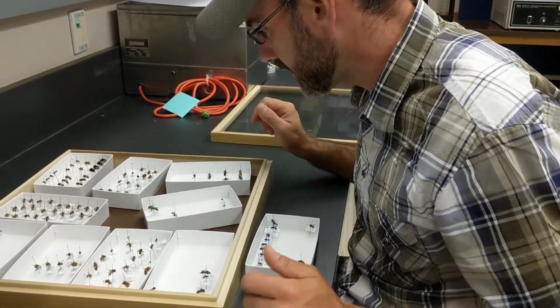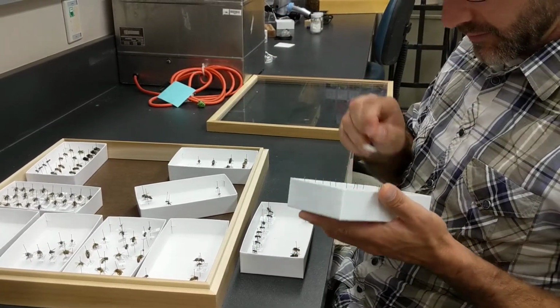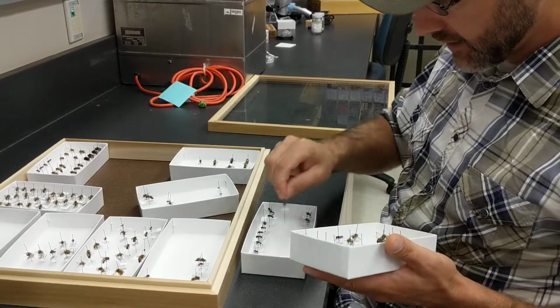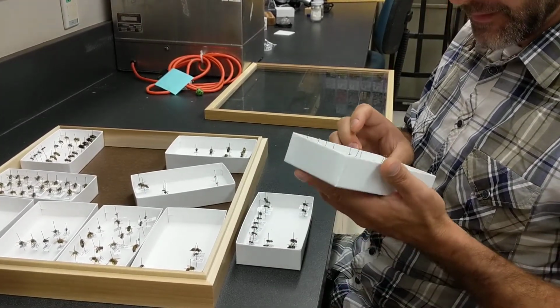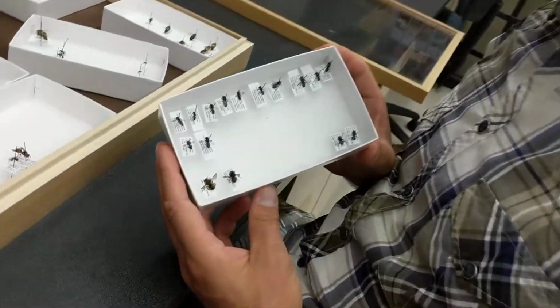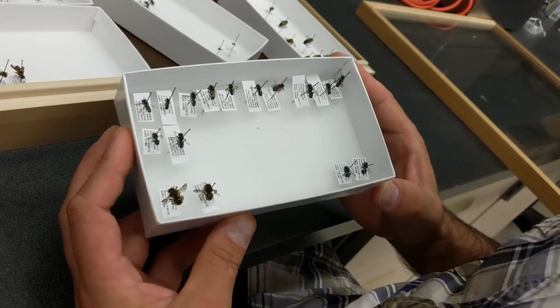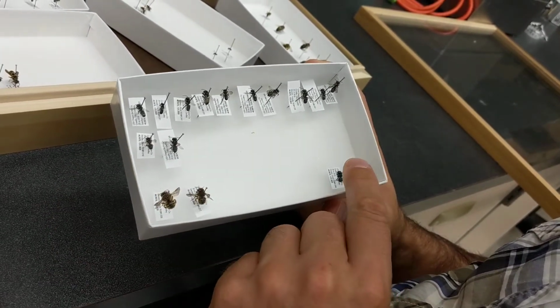So are these all the leaf cutters now? No, there's some over here. So we got one more Osmia, a couple more Megachile. So this is all of our Megachilidae family bees from the box. So we've got the Megachile on top, the Anthidium in the corner, and the Osmia there.